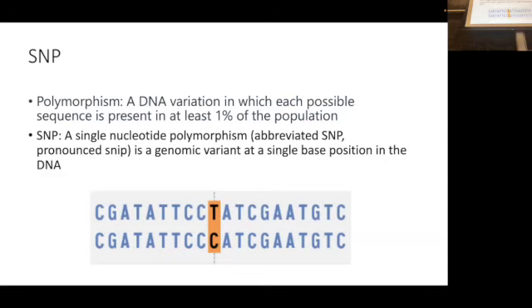let's show the hypothetical chromosome 1, the FASTA file, the reference genome file. The FASTA always starts with a greater than sign, followed by chr1, and then I write down the ACGT.